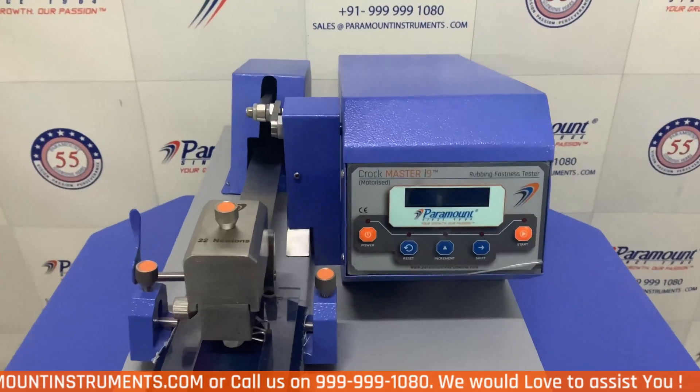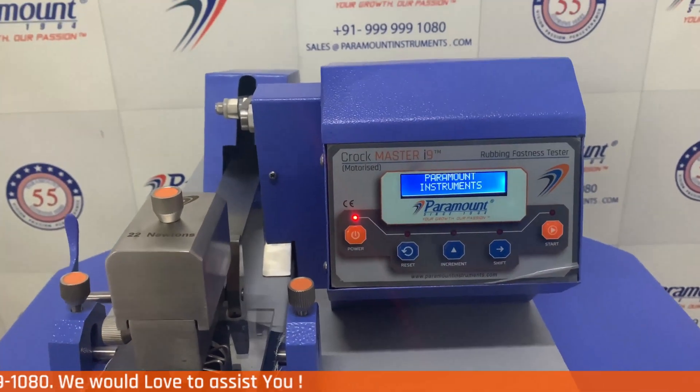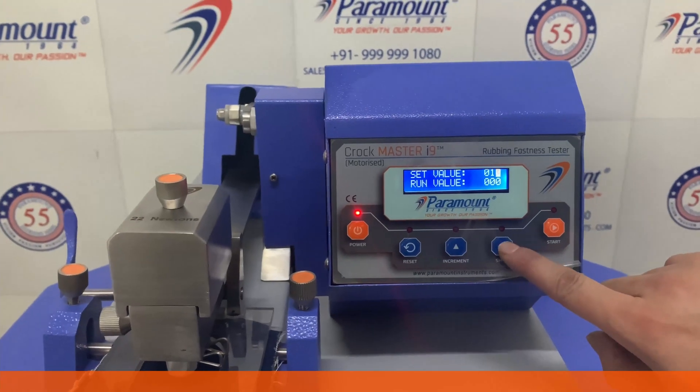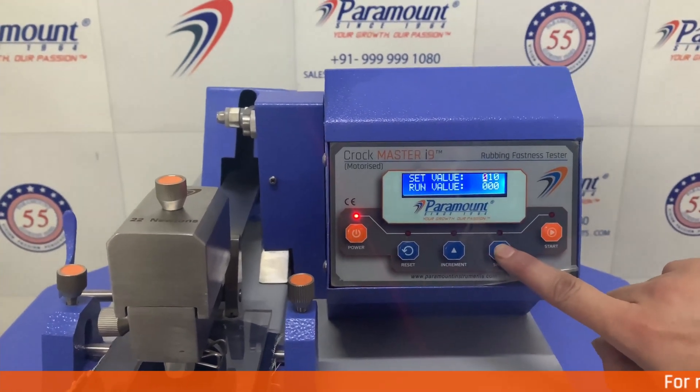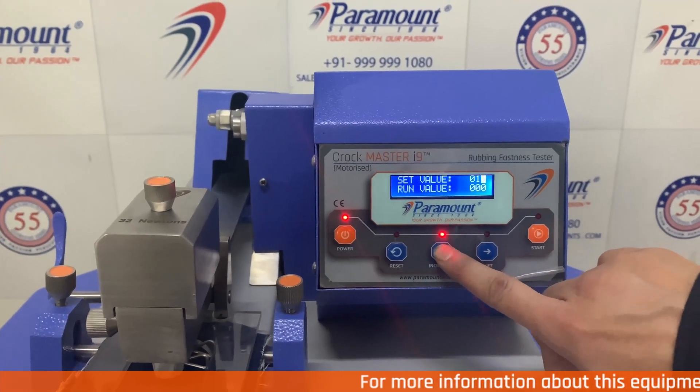Now we move on to the next generation digital control panel of the CrocMeter i9 Digital. Set the value of the number of times you want the rubbing test to be conducted. Here we are setting it to 10.